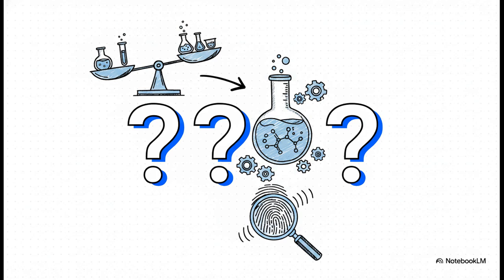By averaging the molar mass calculated from our 2 samples, we finally arrive at the single most important number in our entire investigation. Averaging smooths out any of those tiny, inevitable human errors from the lab, giving us a highly reliable, rock-solid chemical fingerprint for our unknown suspect.